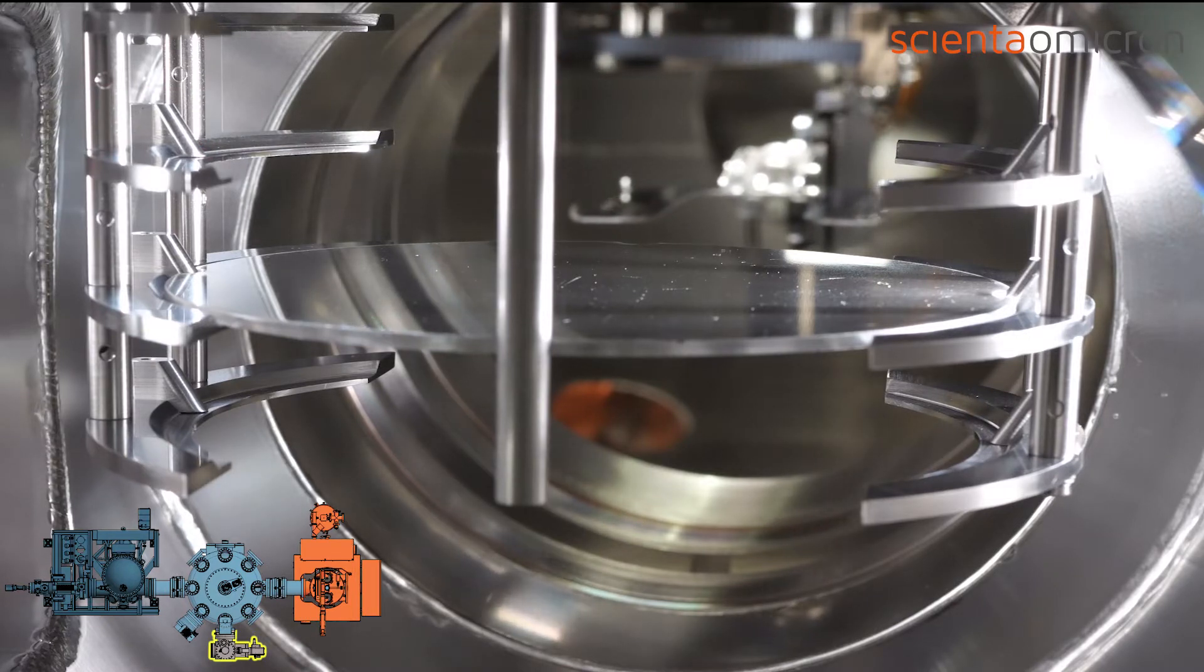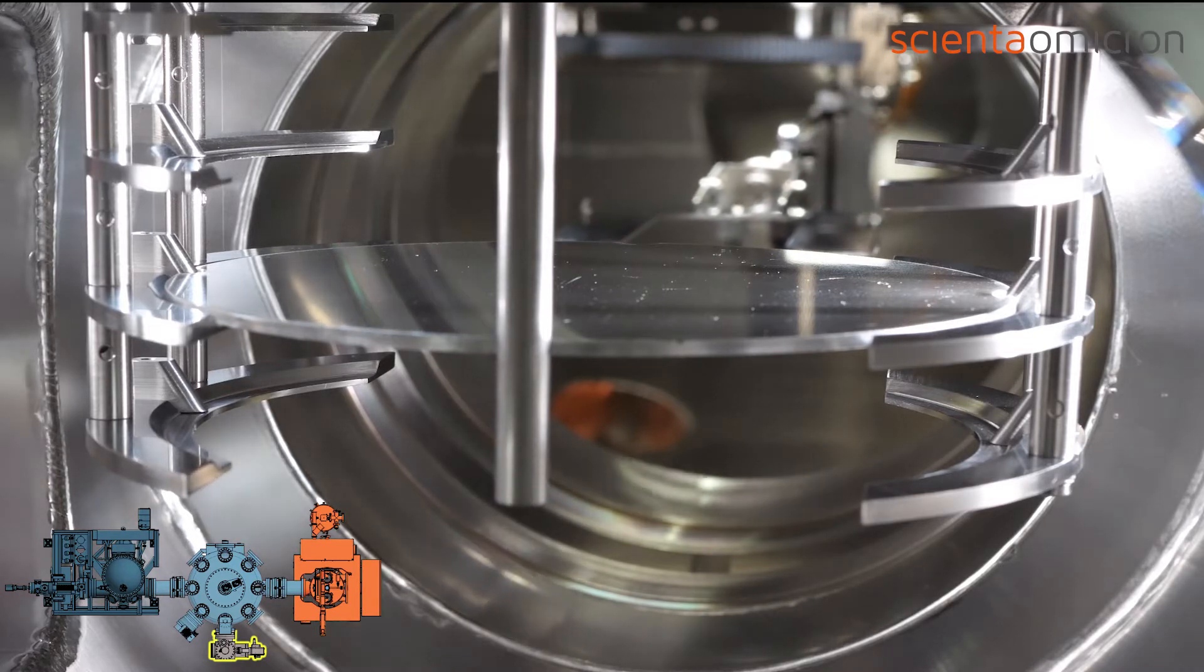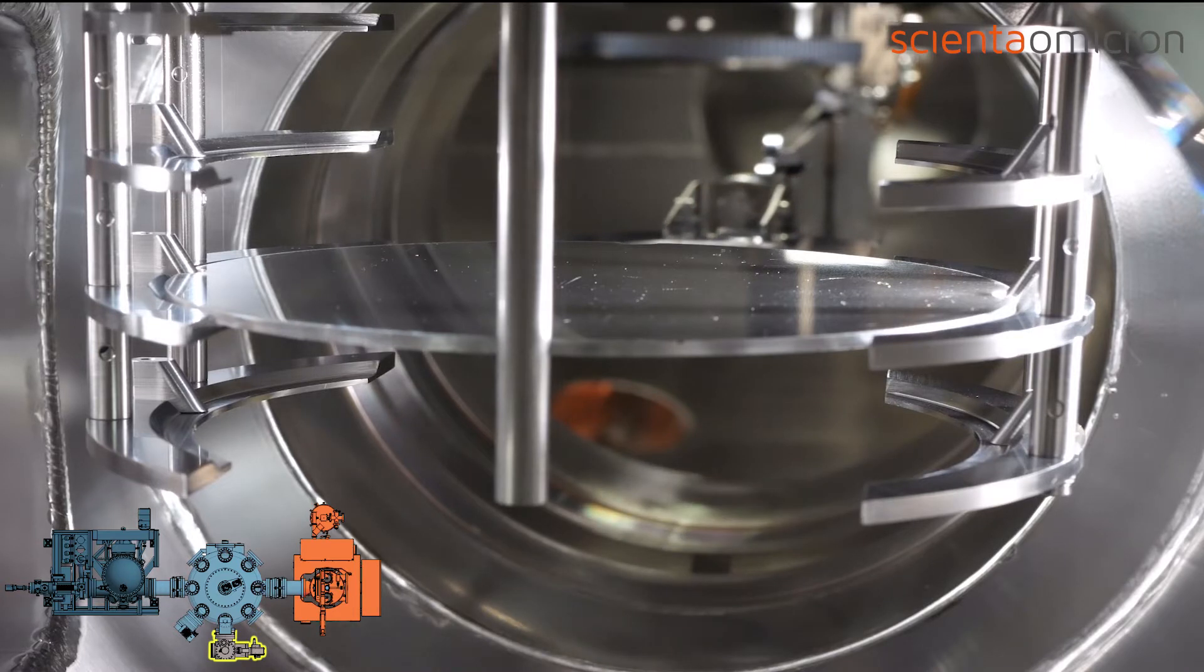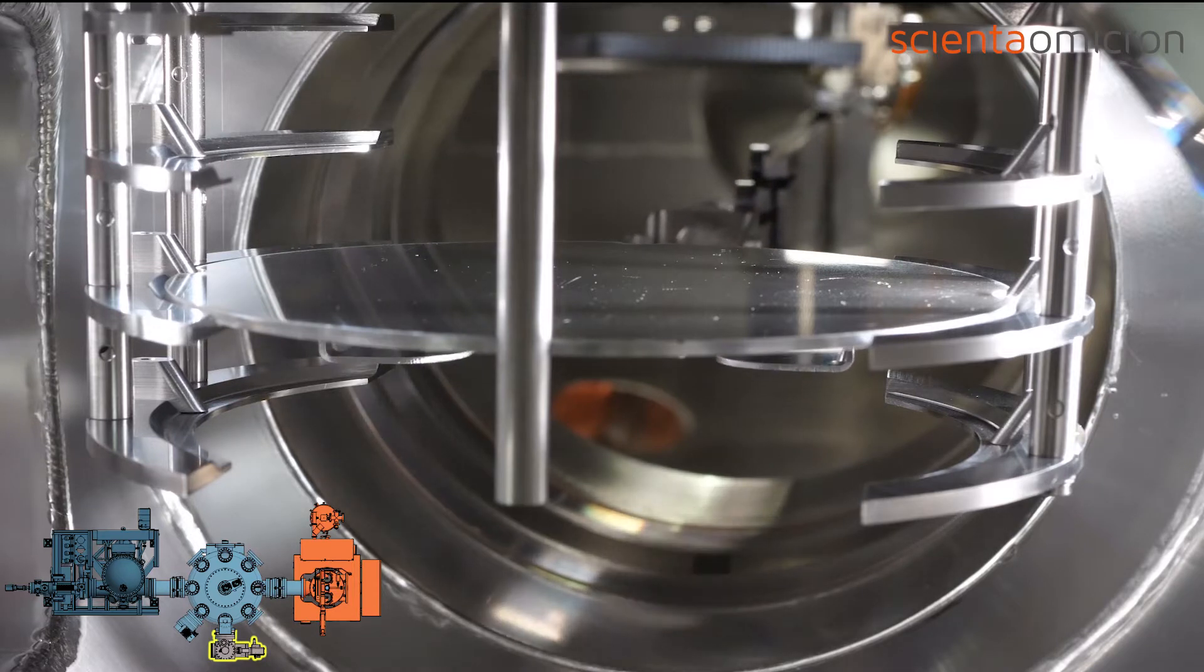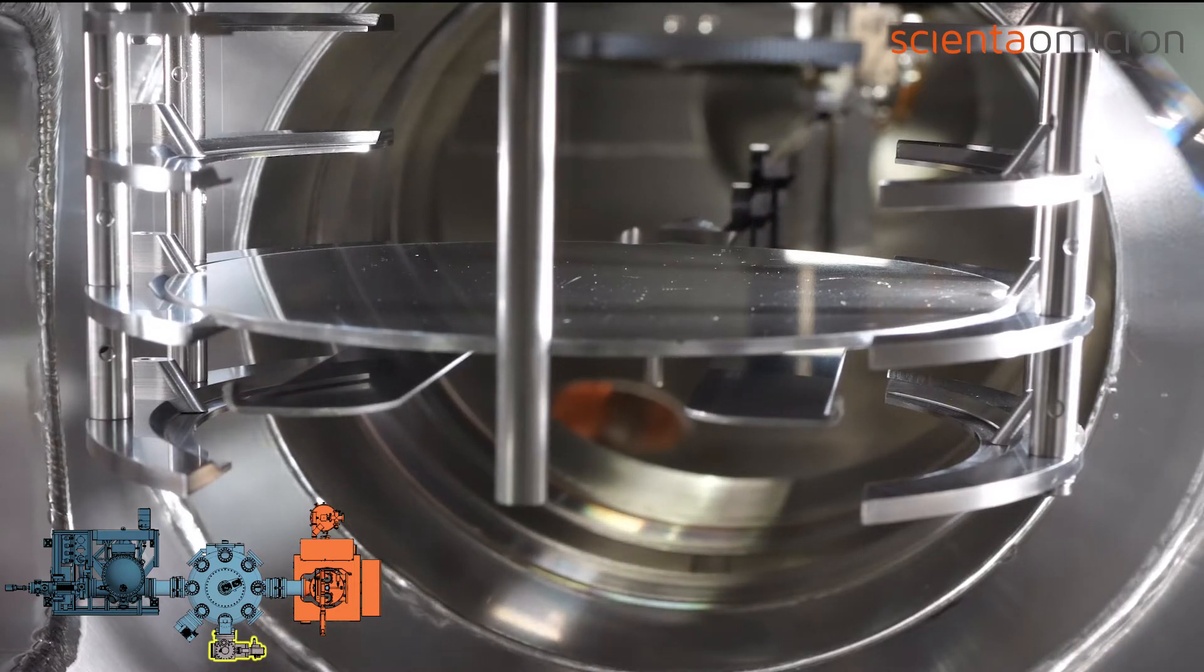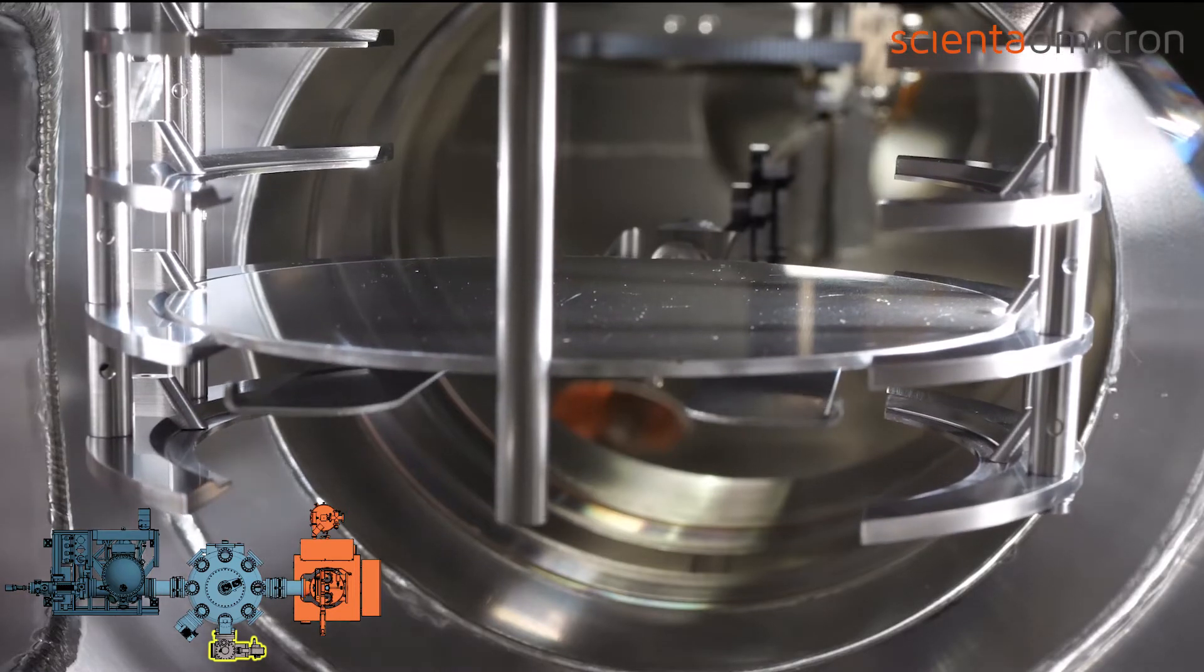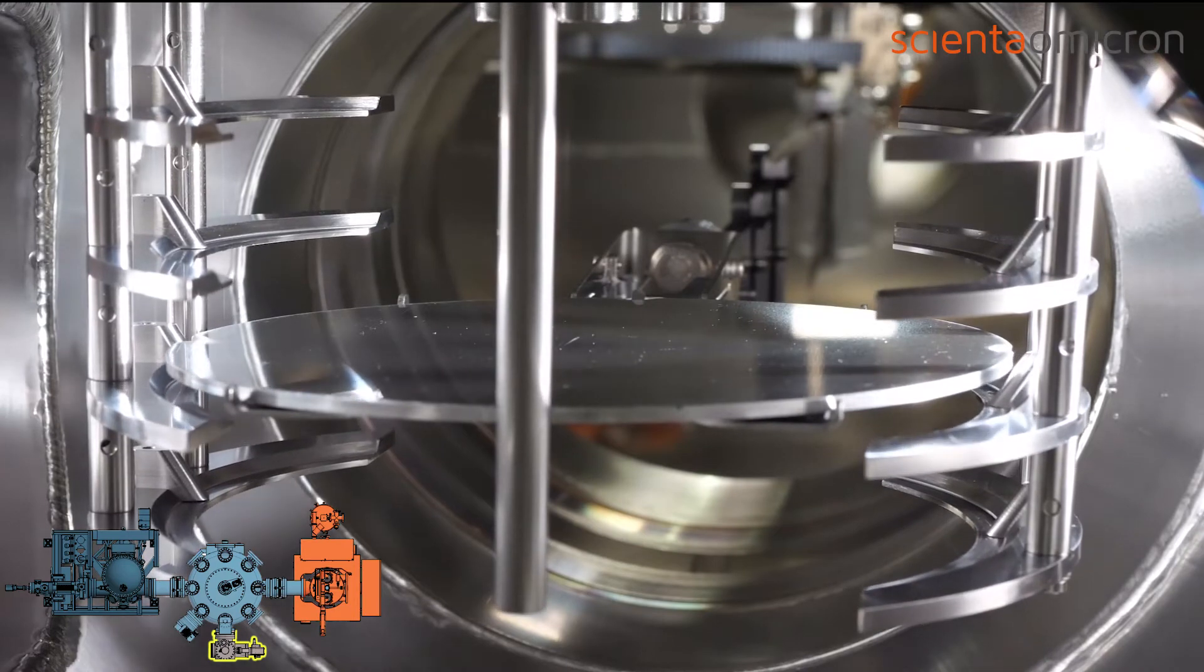The UHV gate valve opens and the wafer fork acceptor, the head of the robotic arm, drives into the chamber. When the fork acceptor is in the reception position, the wafer can be placed on it by lowering the sample storage.